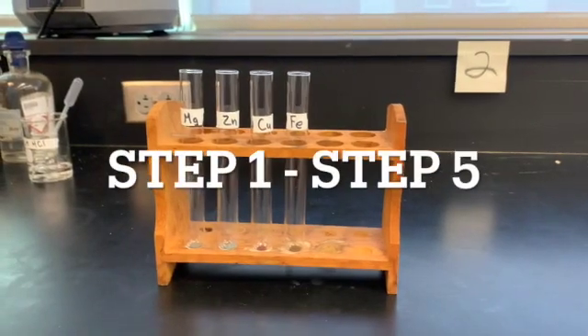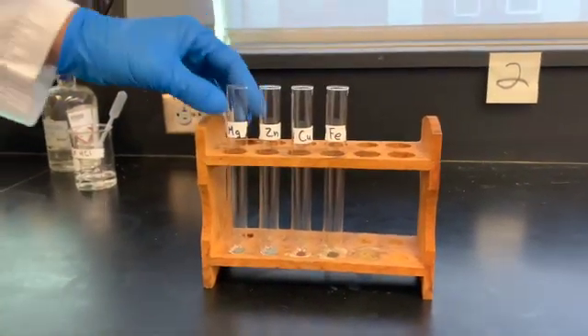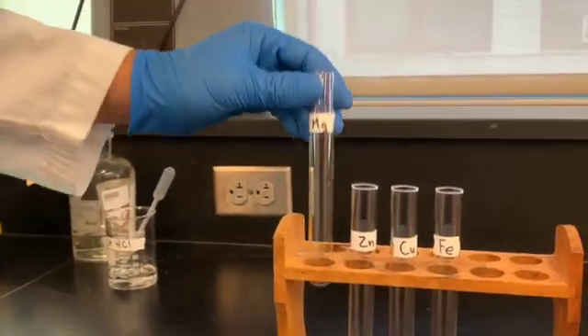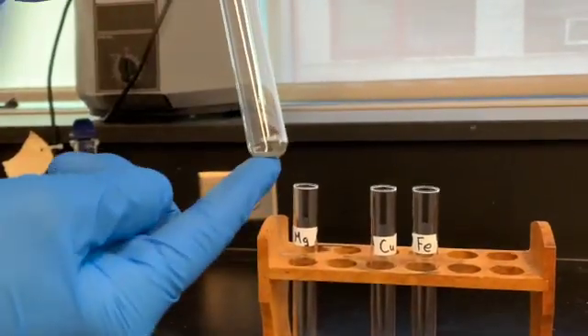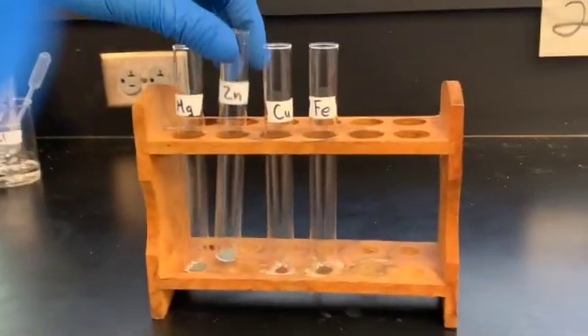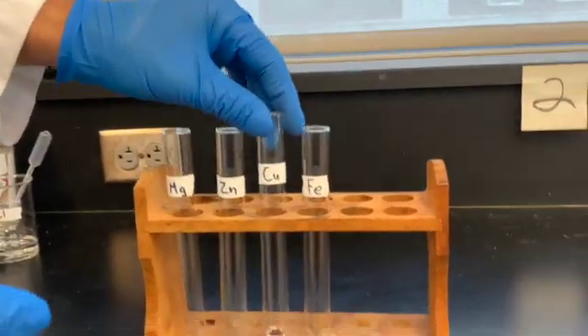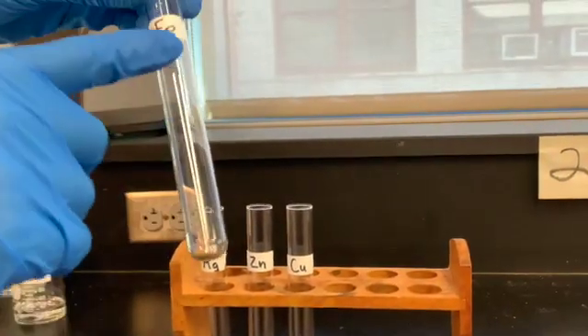Alright, so the first step is to label each clean test tube with the corresponding metal. The first test tube will contain magnesium, the second will contain zinc, the third will contain copper, and the fourth test tube will contain iron.